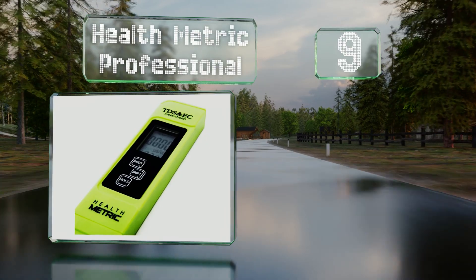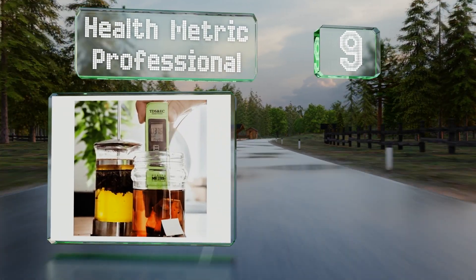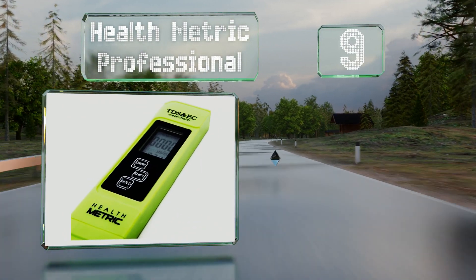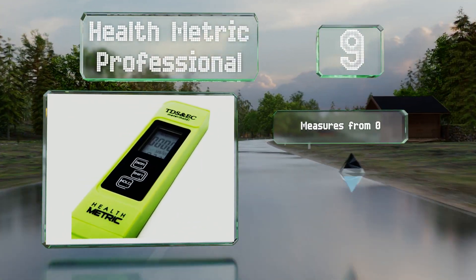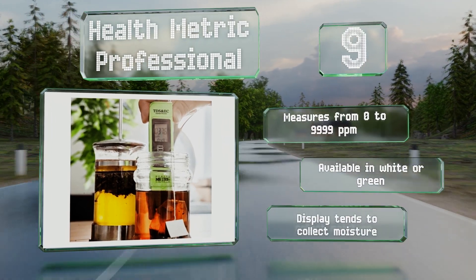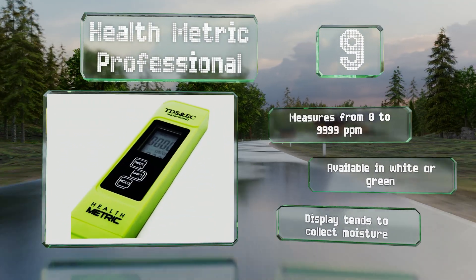At number 9, suitable for use with both warm and cold liquids, the Health Metric Professional comes in at an affordable price with a durable titanium alloy probe and a built-in thermometer. It measures from zero to 9999 parts per million and is available in white or green, but the display tends to collect moisture.